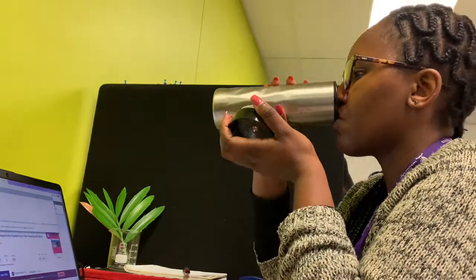Then I proceed to do my lab work, and as you can see, first I write down maybe the equation, the reagents I'll be using, and then the methods I'll be using. Then I'll proceed with my experimental work from there.